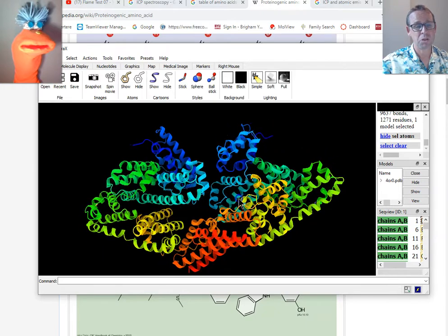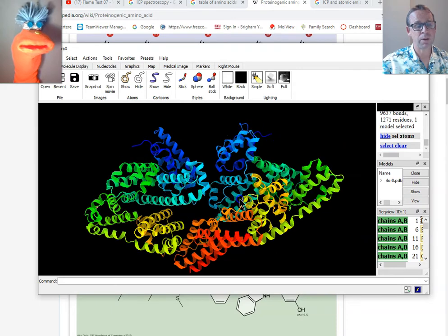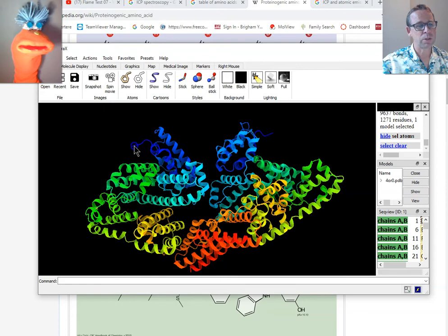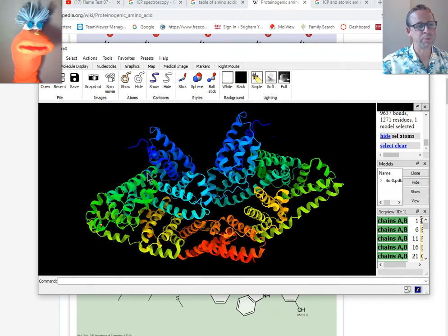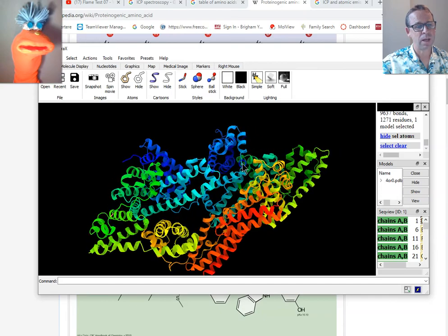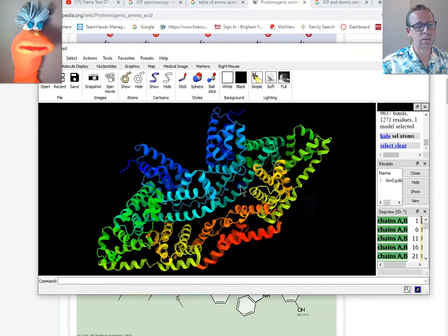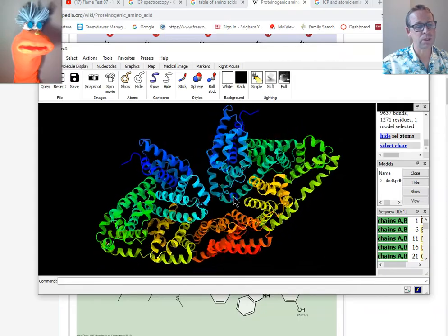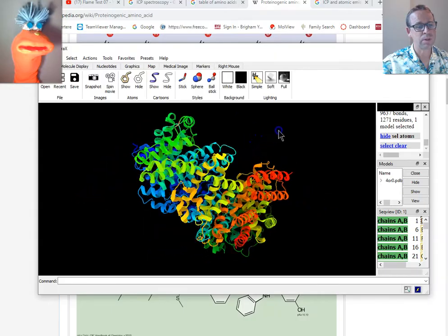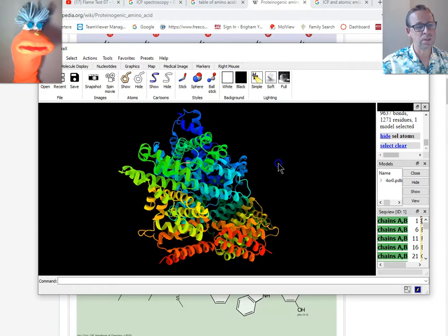It's just a very common protein that is used in biochemistry, usually just for a kind of control. Here's where it starts, the blue region over here, and here's the other side where it ends. And I'm not sure, but it looks like this is not a dimer. Looks like this is just a single strand that runs through. Oh no, there. Let's see. It is a dimer. It is a dimer.